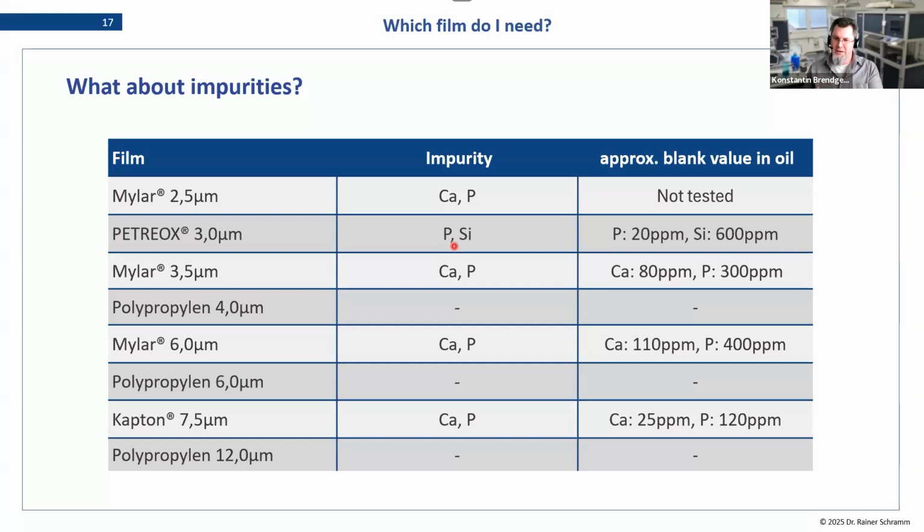When choosing what analyte you want to analyze and what metrics, it's important to think about what is possible. And generally speaking, you want to go for a thin film in order to go for the lighter elements. If you go for heavier, it's more about going thick so that you have mechanical stability and less risk of breaking during the measurement.